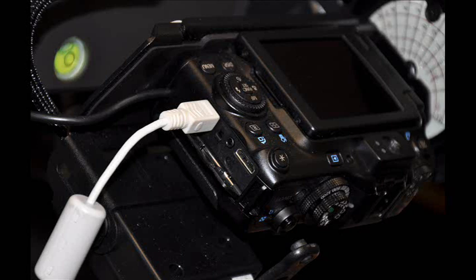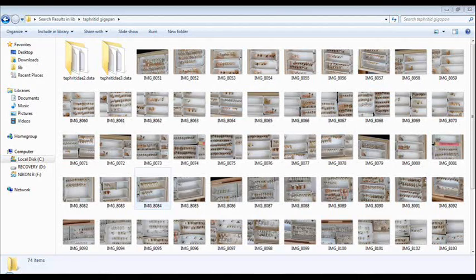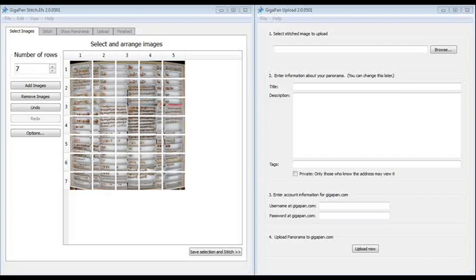After shooting a series of drawers, it is good to transfer the images to a computer. We do this by accessing the USB port on the camera while it is still attached to the robot, by connecting a wire from it to the computer. Once the images are transferred into folders for each drawer, they can be stitched and, if desired and a user account is available, uploaded using software provided by GigaPan. Each program is simple and user friendly, so we will not go into them here.